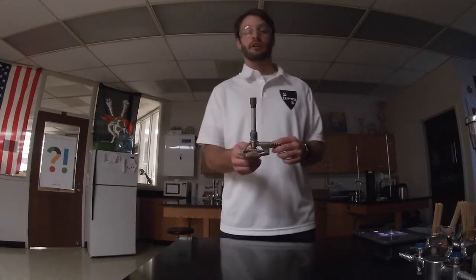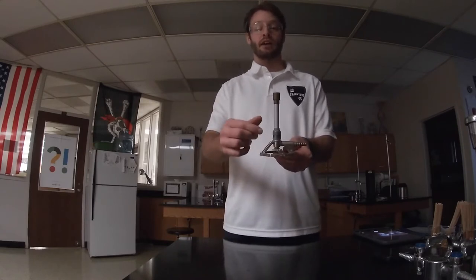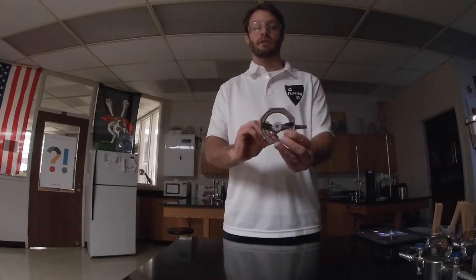The difference between a Tyrell burner and a Bunsen burner is that a Bunsen burner will have a knob on the side, whereas a Tyrell burner has a valve on the bottom.